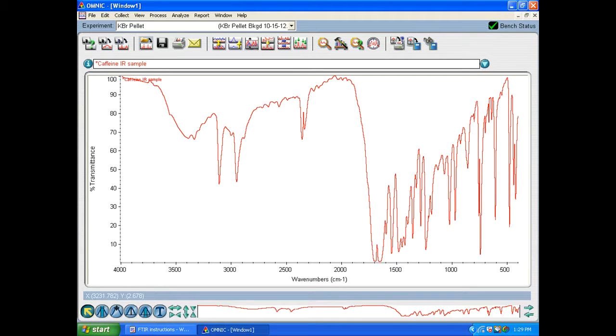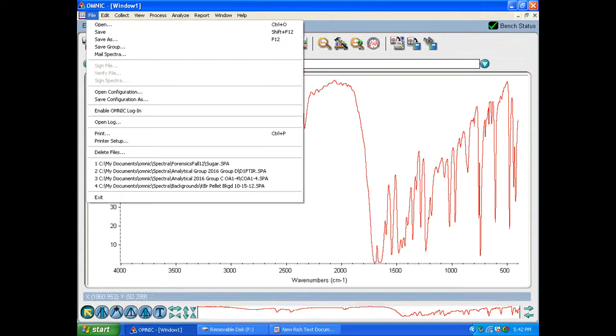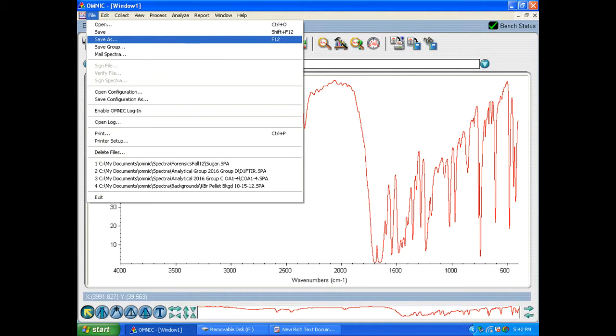If you need to save your spectra all you have to do is go up to file and then save. And you can choose where to save it and choose what to name it. So in this case we'll call it caffeine IR sample like we had before.